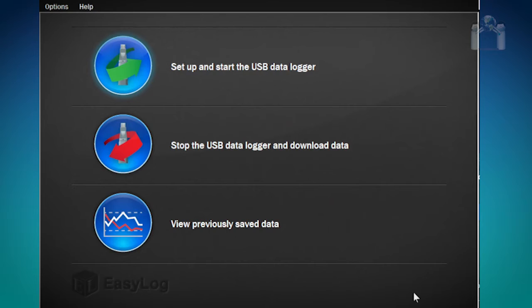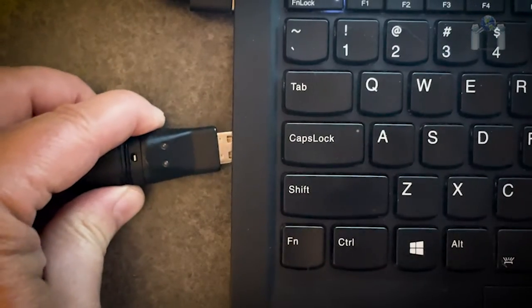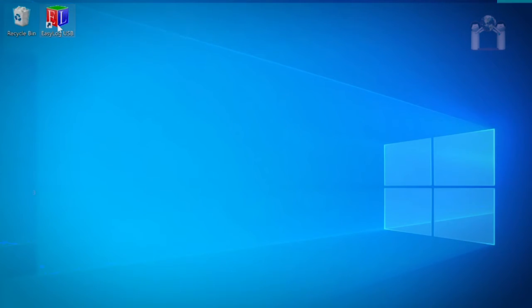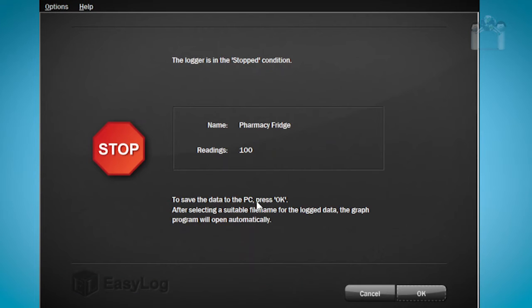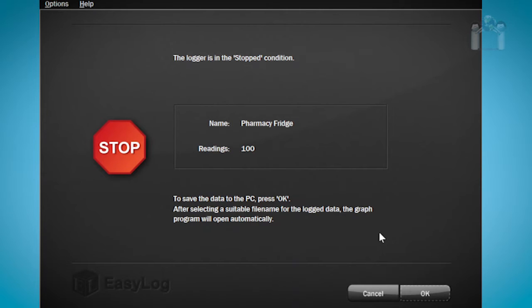For your convenience, here is a list of LED codes and their meaning. You can download the data from the data logger to your computer at any time. Remove the cap from the data logger and plug it into the USB port on the computer that has EasyLog USB installed. After launching EasyLog USB, select Stop the USB Data Logger and Download Data. You will get a prompt asking if you are sure you want to stop the logger and download the data. Select Yes. A message will appear saying that the data logger has been stopped, and you will see the name of the data logger and the number of readings that it took. Press OK and a window will appear allowing you to select where to save the file and an option to give the file a different name. Click Save and the download will begin.